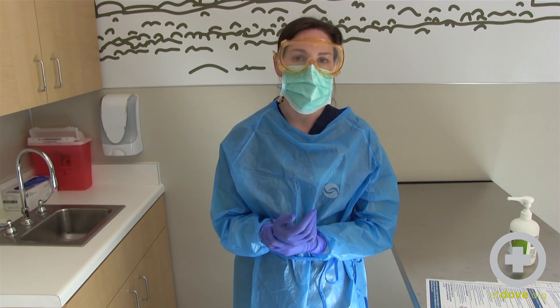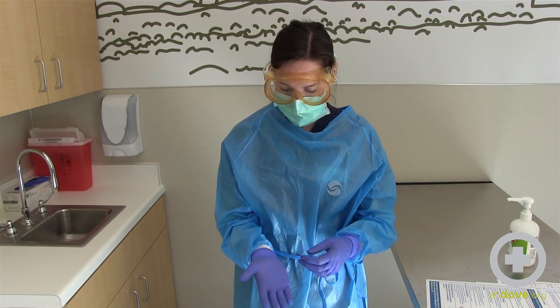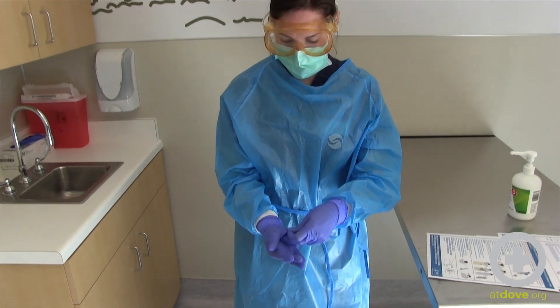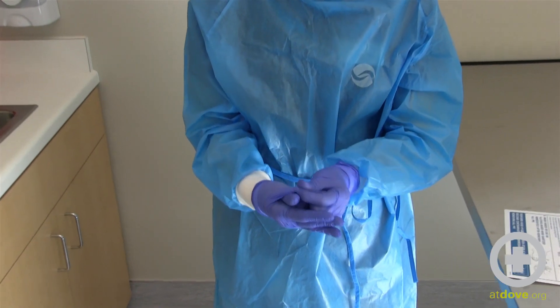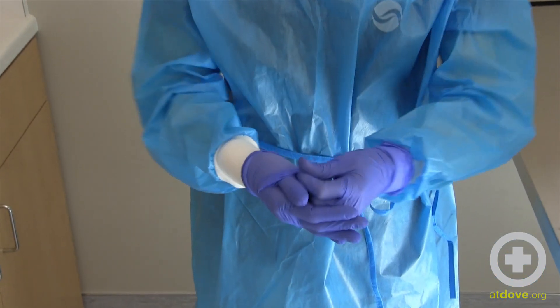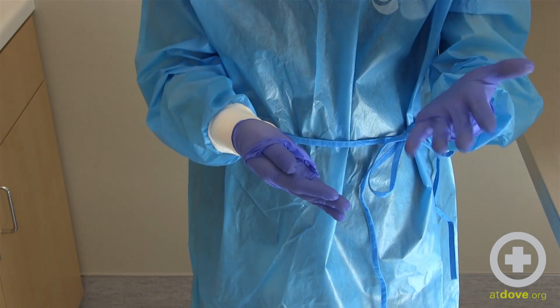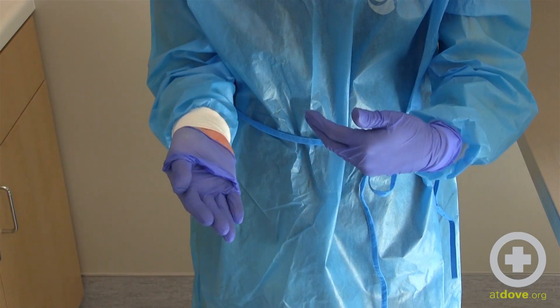In example one we're going to start with taking our gloves off. You will want to hold your palm out, carefully pinch your glove and start to work the glove all the way down. Remember that your glove and everything on the outside is considered contaminated, so you want to be careful not to touch your dirty glove to your clean hand that is slowly being exposed.